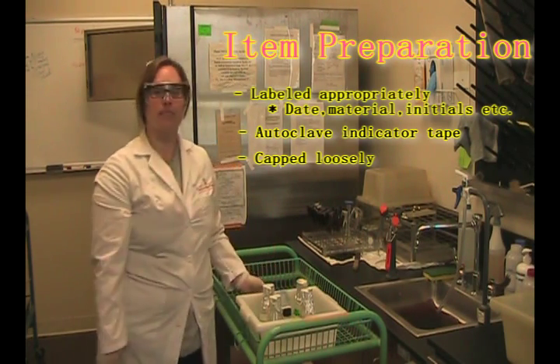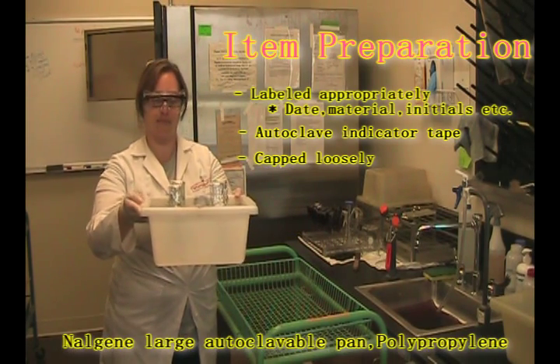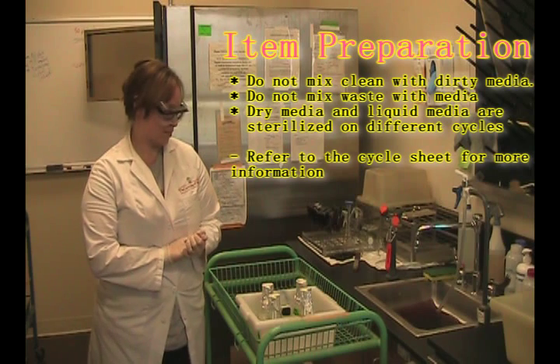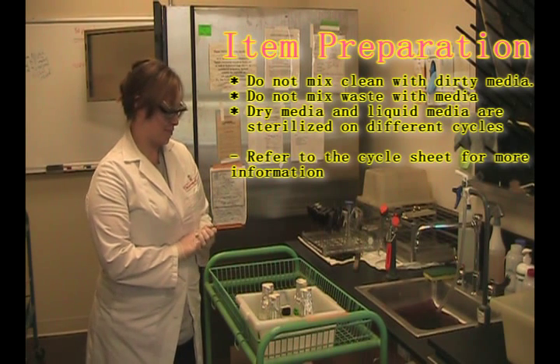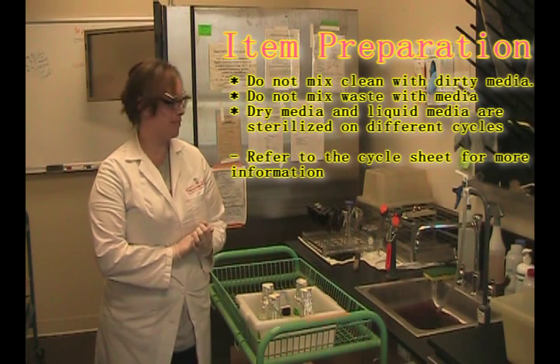All of your items also need to be in one of our autoclave buckets from Nalgene. It's also important to note that you don't want to mix clean media with dirty media or trash. Make sure that you keep all of your dry things with dry things and your liquid things with liquid things, because they'll run on different cycles.